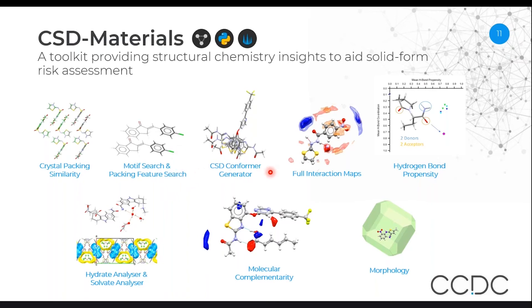We have a conformer generator. This uses statistics from the CSD in order to generate realistic-looking molecules. This is very useful if you only have a two-dimensional structure and you would like to see what a likely three-dimensional arrangement might be.